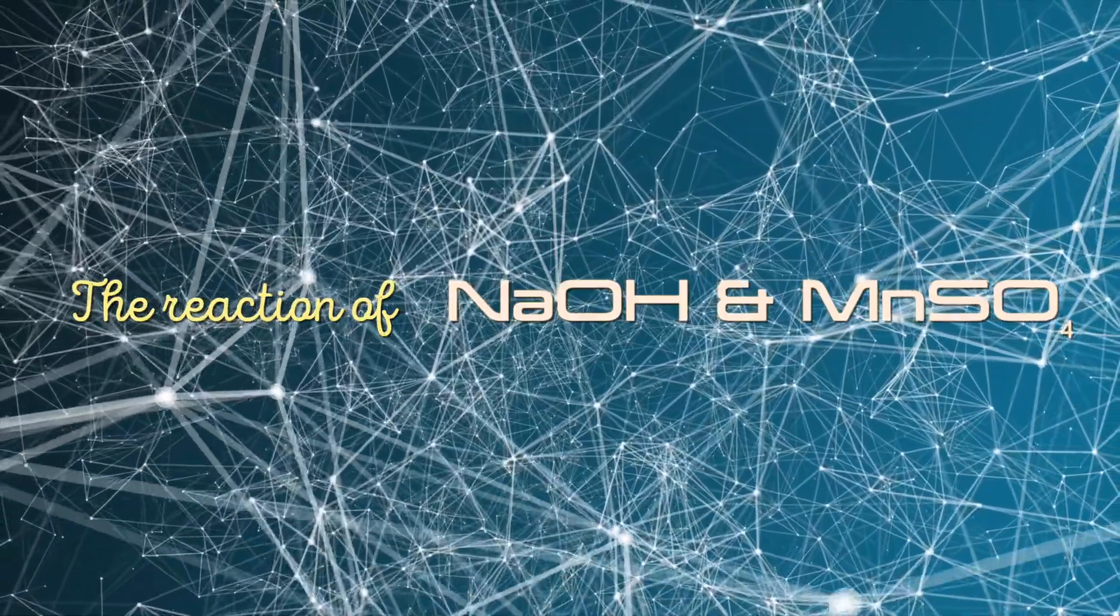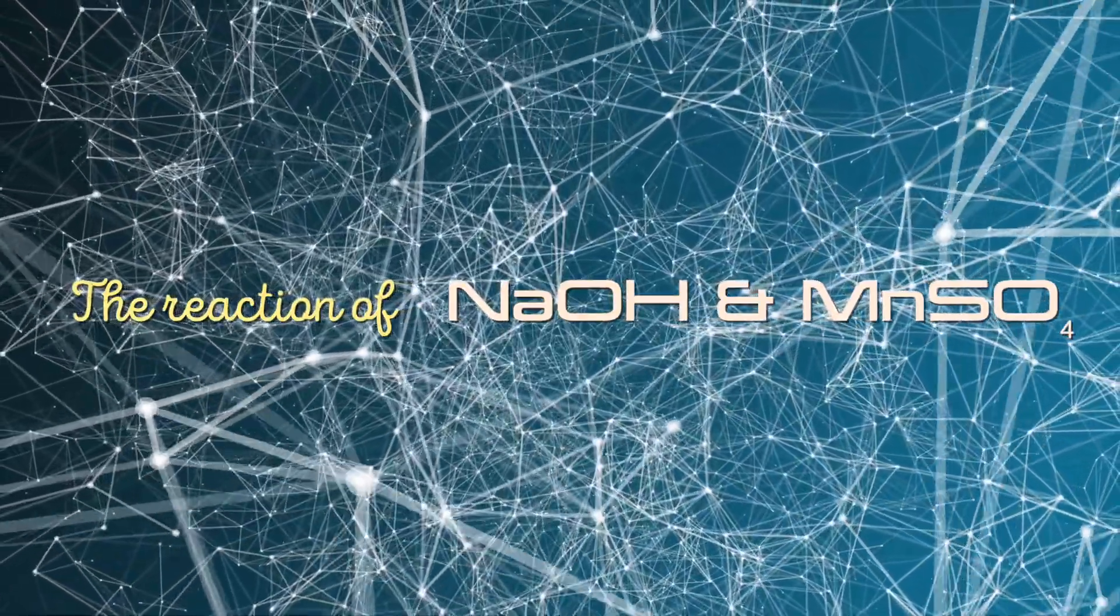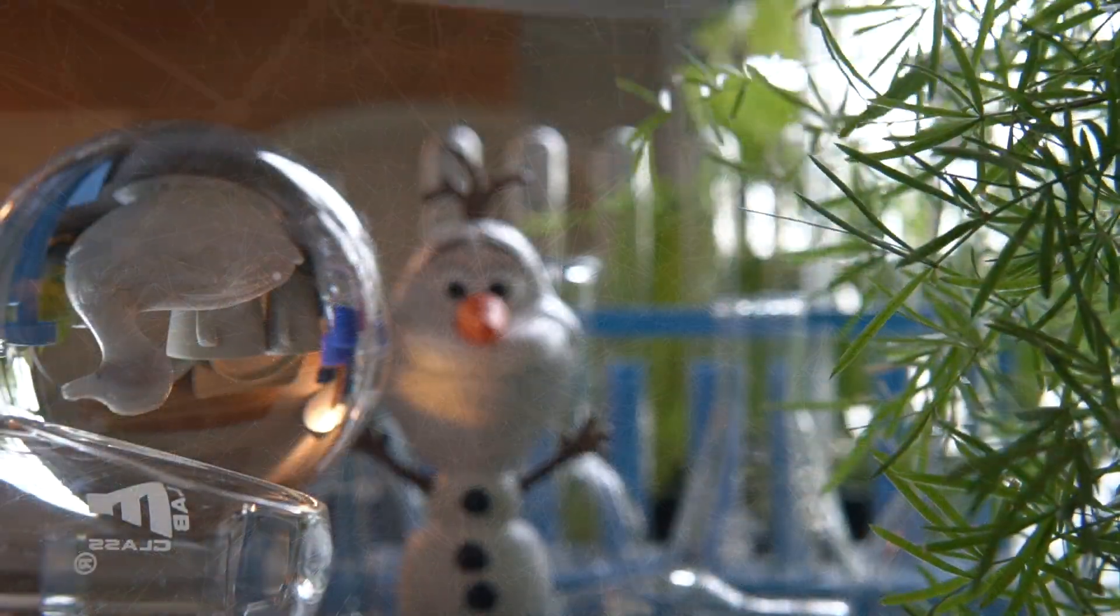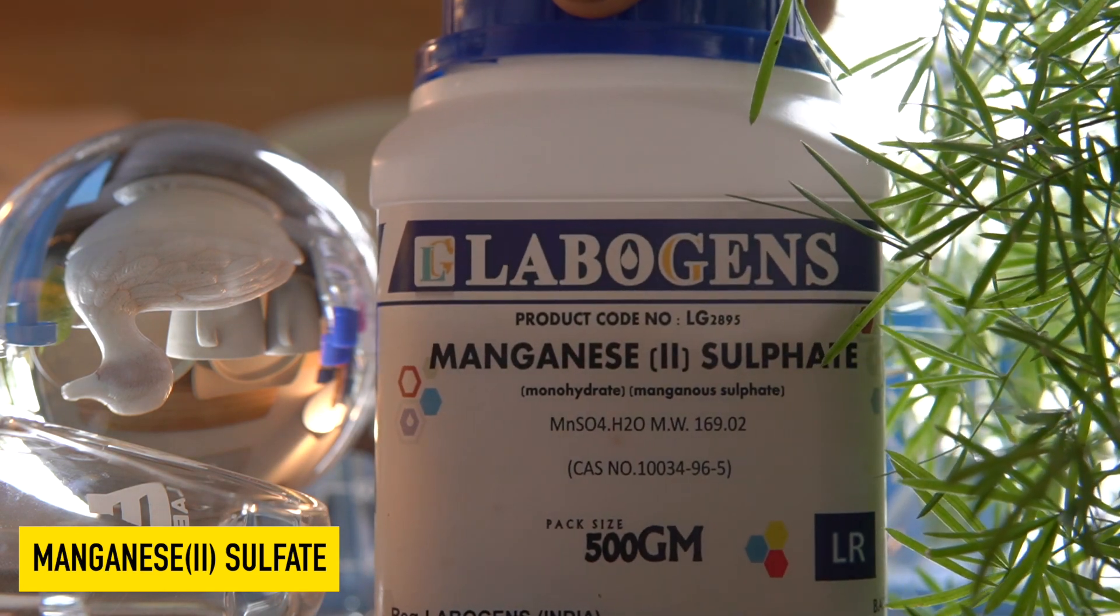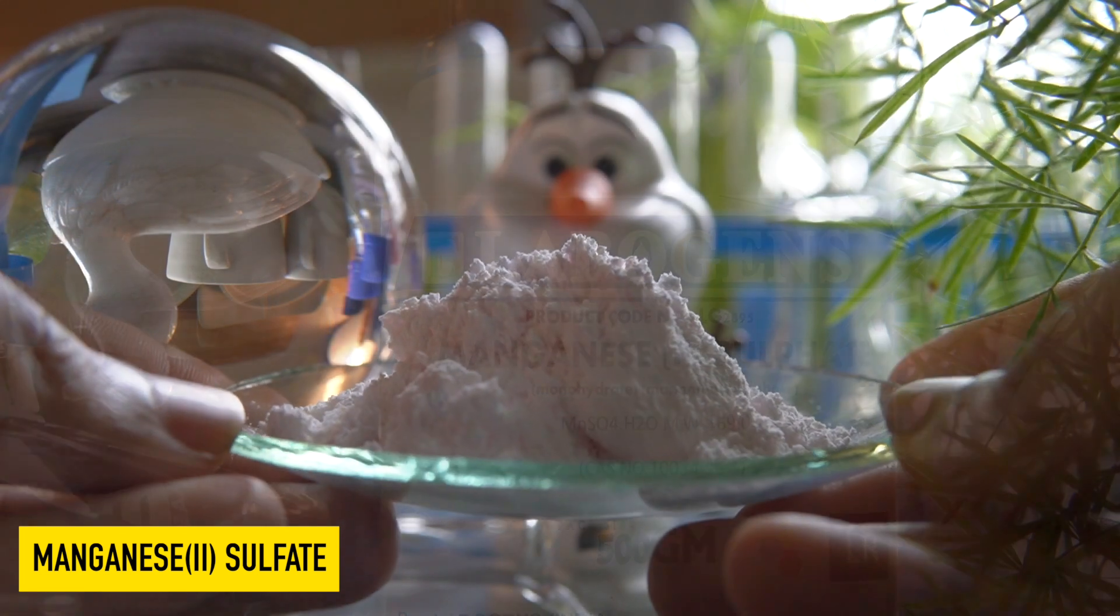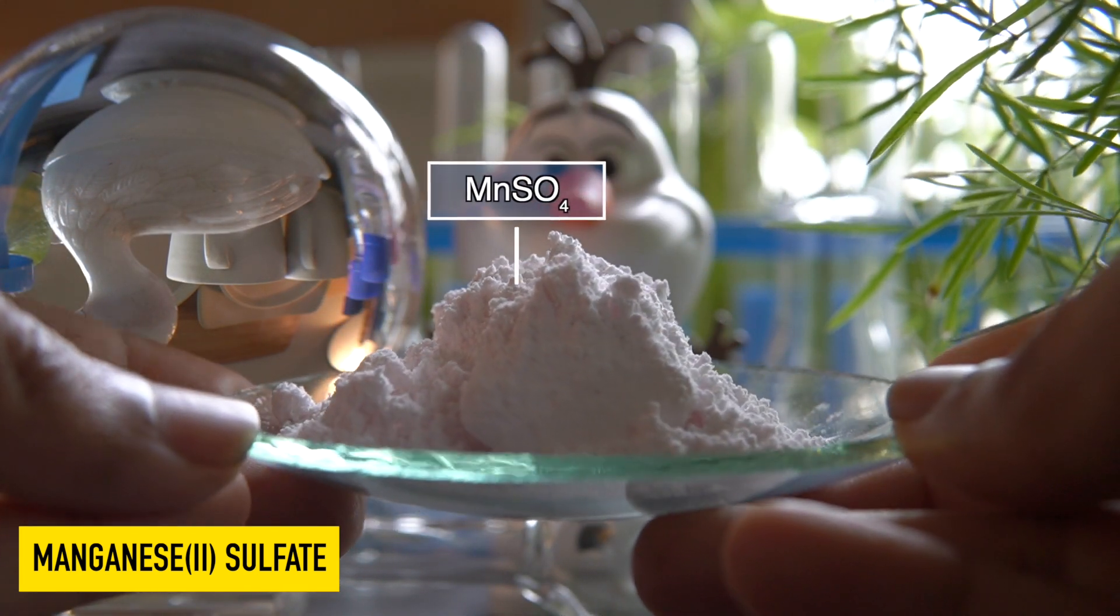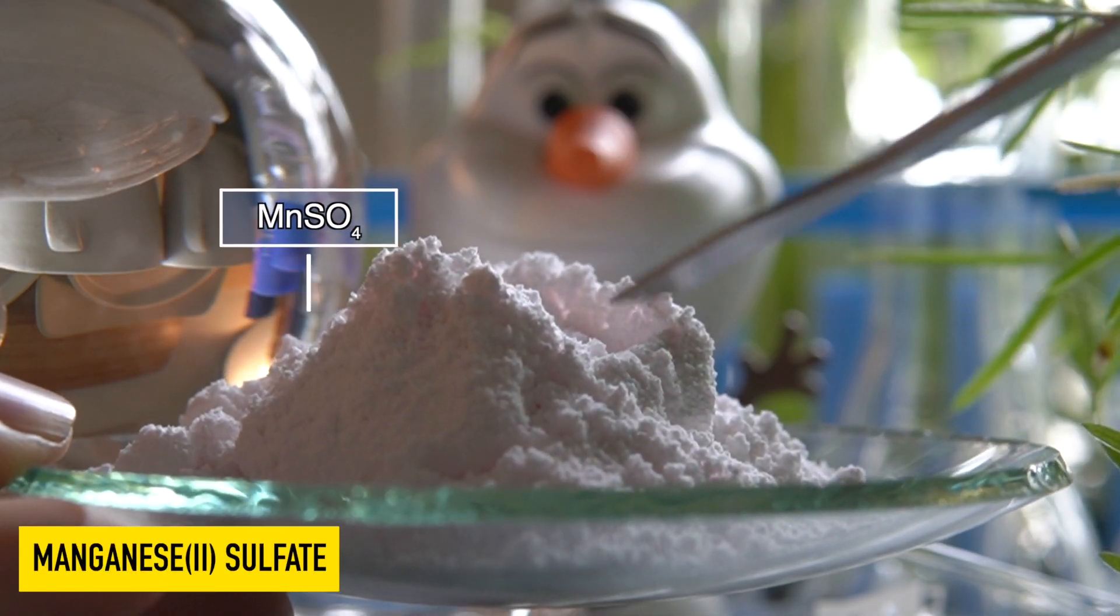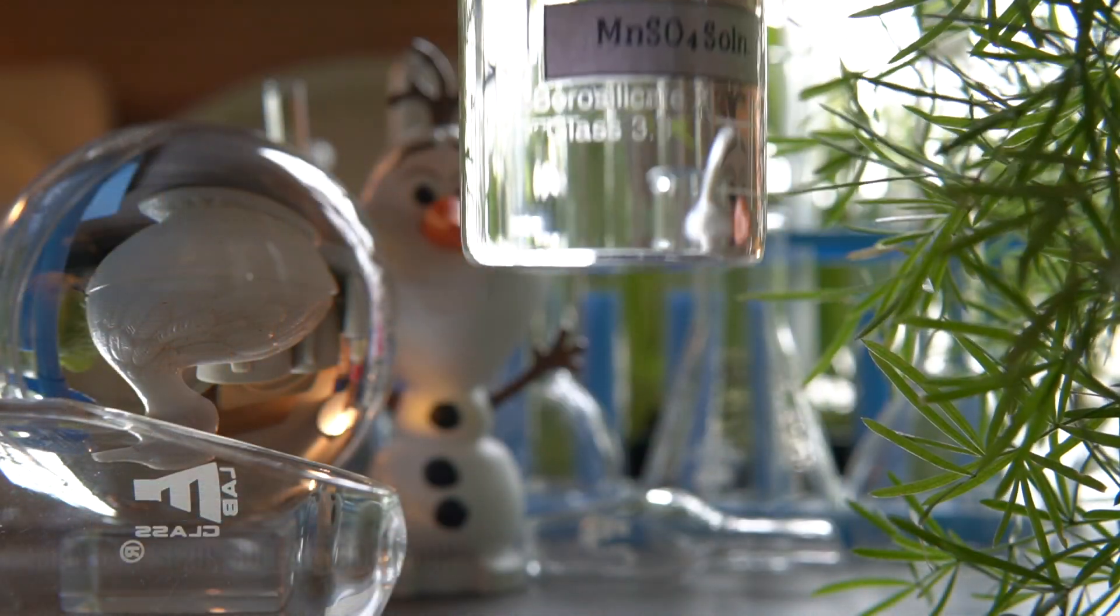Today we are going to discuss the chemical reaction between sodium hydroxide and manganese(II) sulfate. This is MnSO4 salt, slightly pinkish in color and highly soluble in water, so it can easily dissolve in water to make a homogeneous solution.